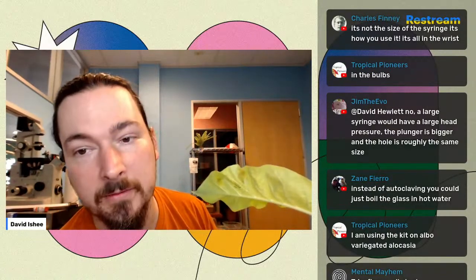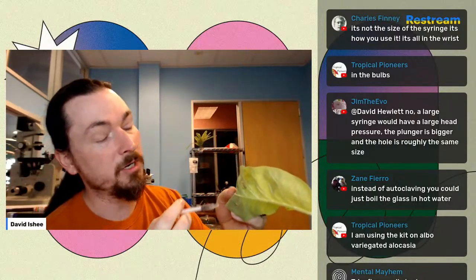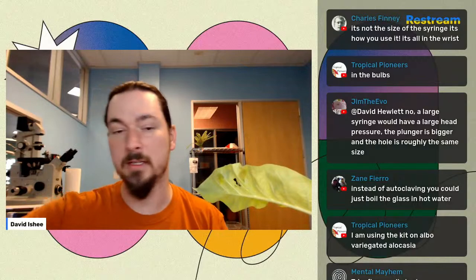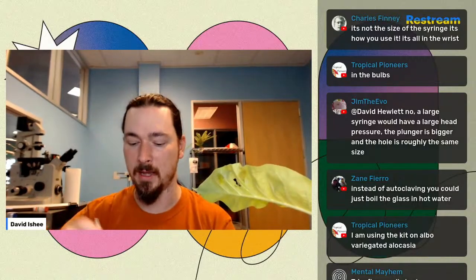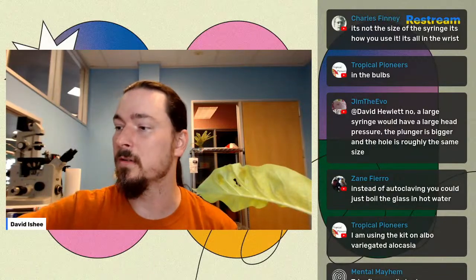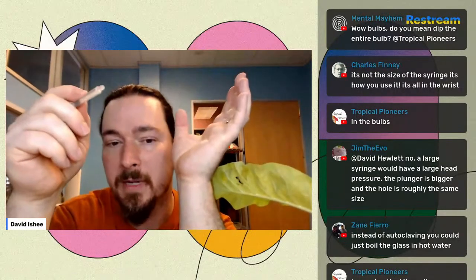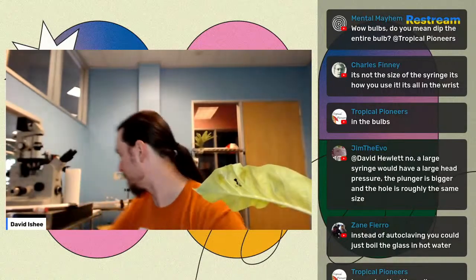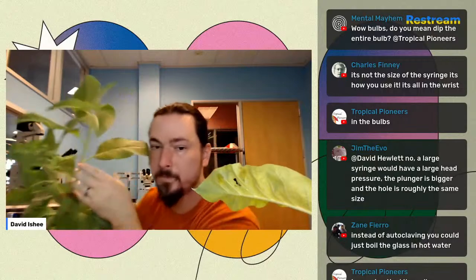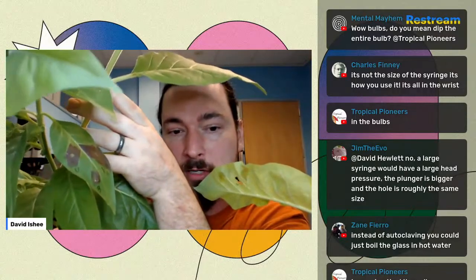One of the things I'm seeing a lot of now is a lot of people are having expression in extremely localized areas. So one thing I want to be clear about is that you really want to let it spread if you're trying to get a bigger spot. Now, if you're trying to write something, and I've done words, you want it to be a finer pixel size. But the problem is, here you can see on this one that these little circles are the actual injection sites. So the pressure's really high.